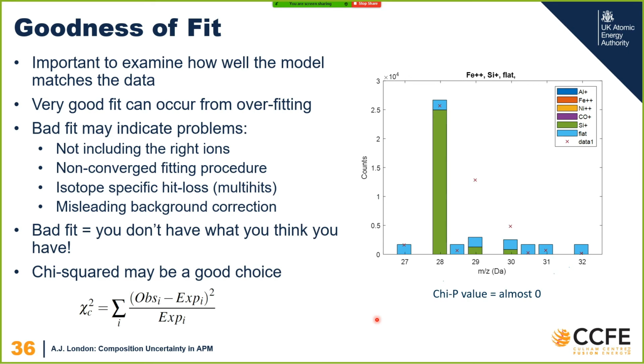For example, chi-squared, the fit for this particular choice, the chi-squared p value is 0, where the p value is like the p value we're familiar with. Anything less than 5% you would maybe consider as being significant. The p-value here is 0.0027. So this is still really tiny, but you can see the fit here is really good.